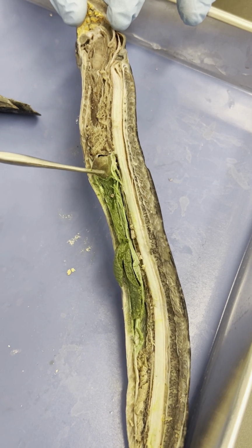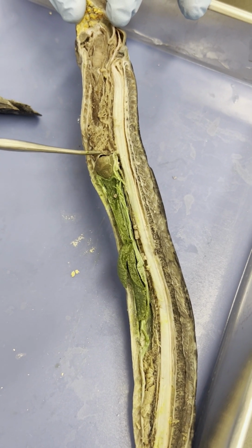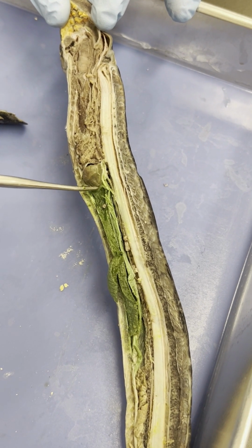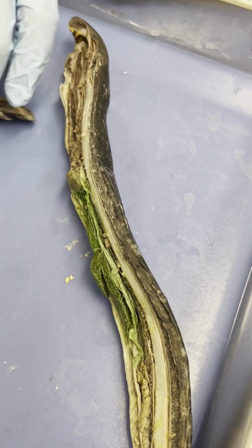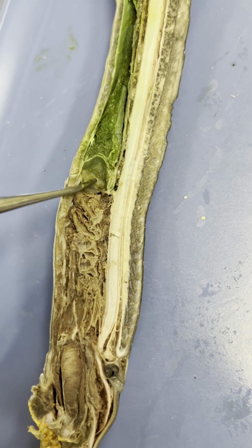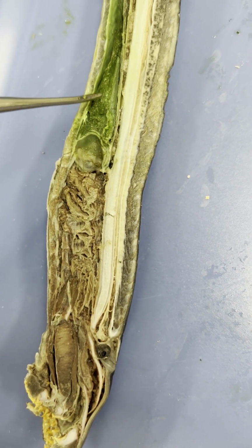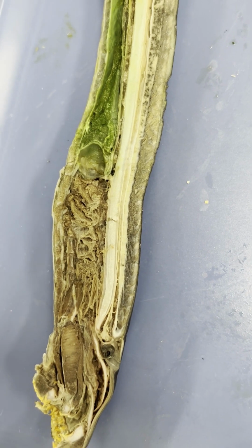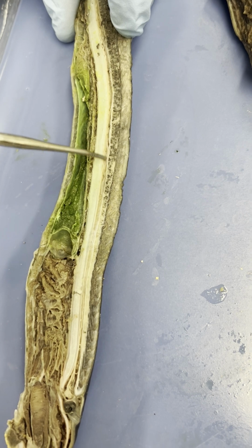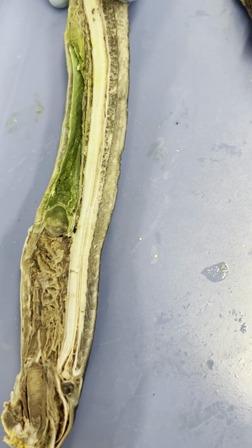We also have our heart, which is right here. Hopefully you guys know the function of the heart. And you guys also have on your work assignment the pericardial cavity. So the pericardial cavity is where the heart's actually located. Here's the other side. There's your pericardial cavity. And just for funsies, I'm looking upside down. Here's actually the liver right here. And you guys know, you can't tell me right now, what this structure is and what this structure is. Hopefully you guys know, okay?